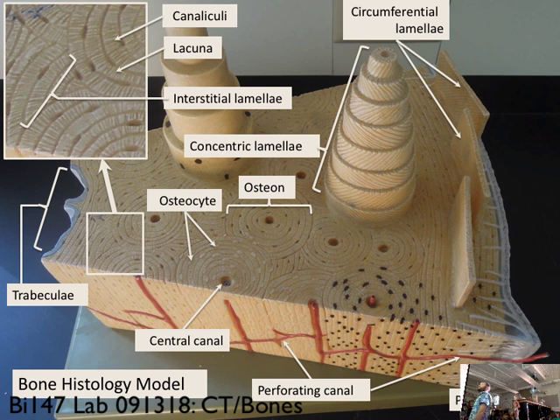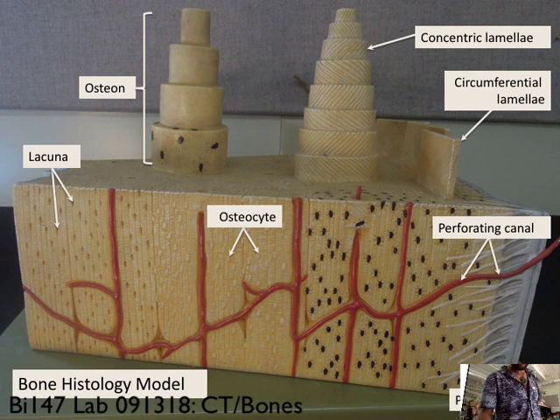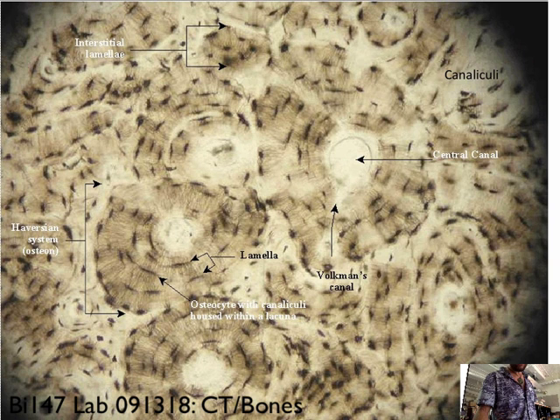Okay. Is there anything else? I think that's pretty good. Is trabeculae on the list there? No, it's not. So side view, let's keep moving. Here's a zoomed out view, probably similar to what you've been seeing in your scopes on the bone.